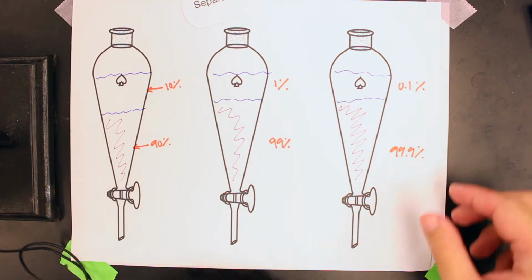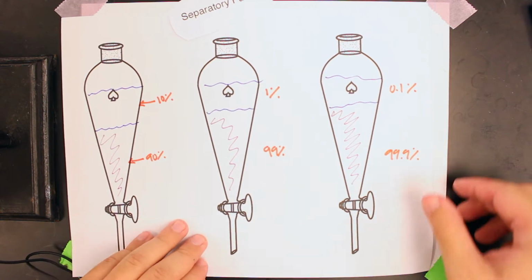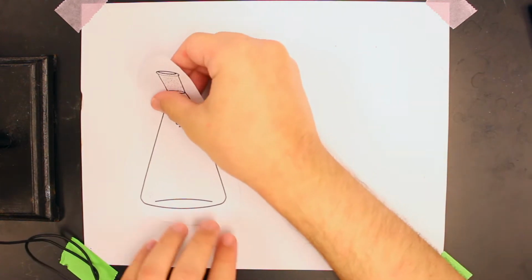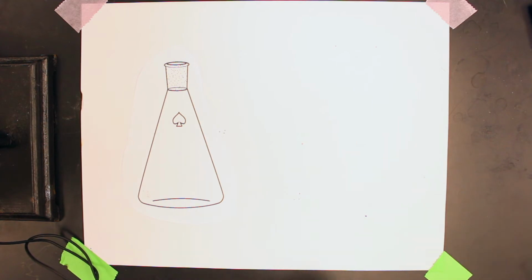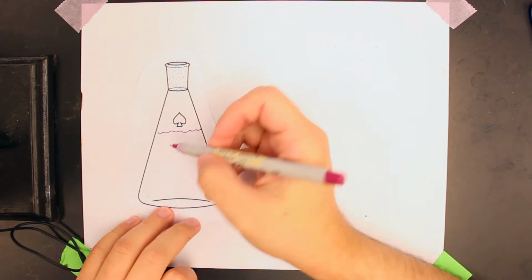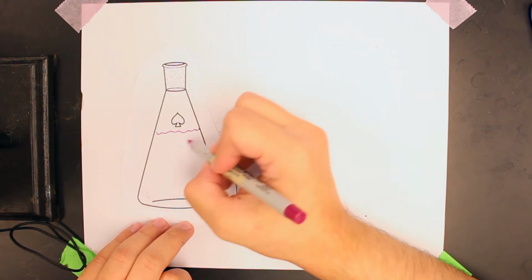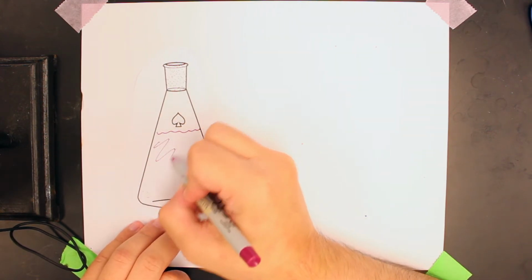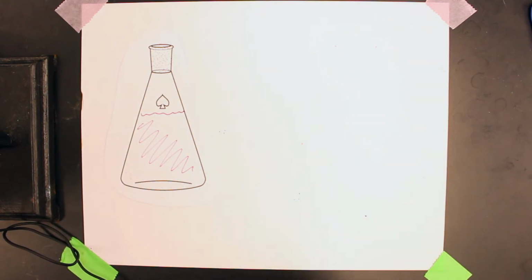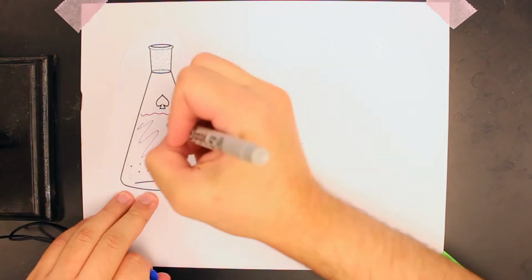in the experimental section. So the final thing I wanted to mention is, once we have our dichloromethane extracts, we want to put them into an Erlenmeyer flask, or they'll be collected in an Erlenmeyer flask. And the issue is, although we separated it from water, there's still going to be some water molecules within our DCM extract. So this is our DCM extract, but there's still going to be a little bit of residual water in there.